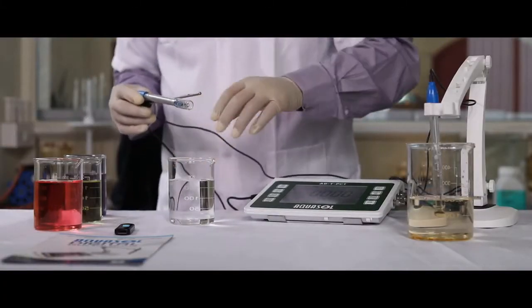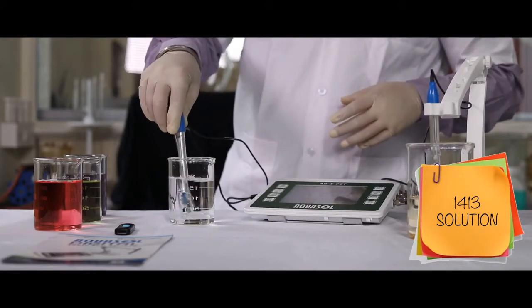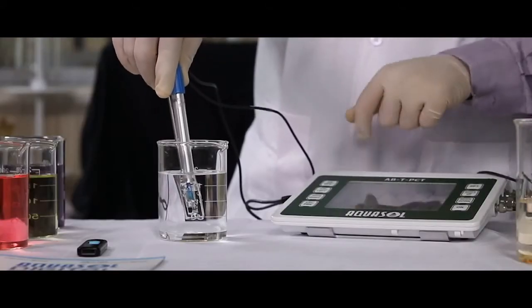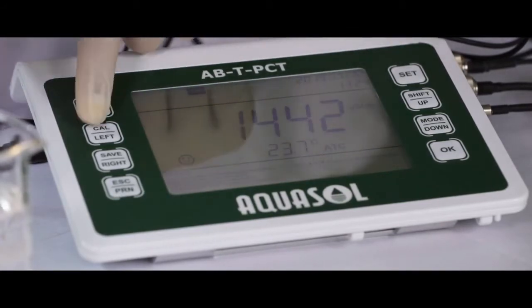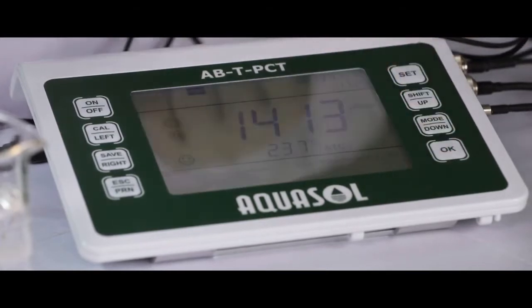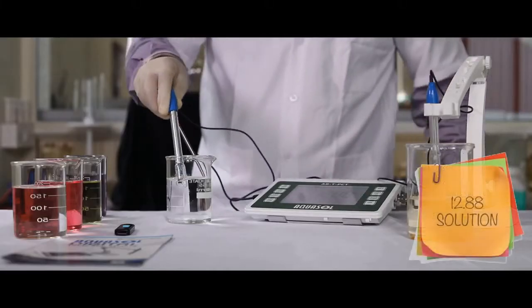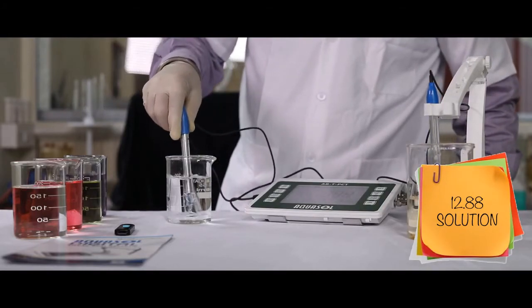Place the conductivity electrode in the standard 1413 solution. Once the reading is stable, a smiley emoji will appear on the display. Press the CAL key to start calibration and then press OK to calibrate. Repeat the same procedure for the 12.88 buffer solution and then press OK.